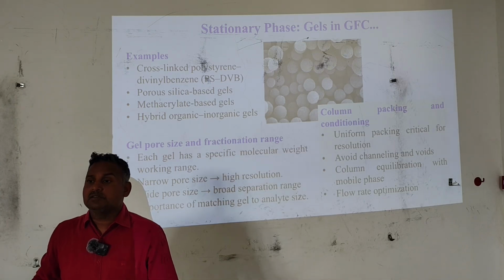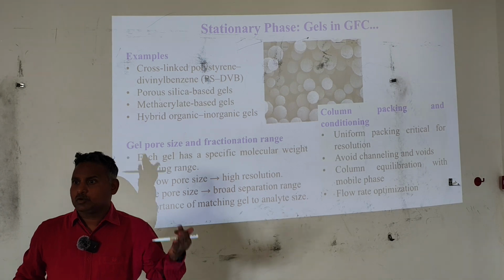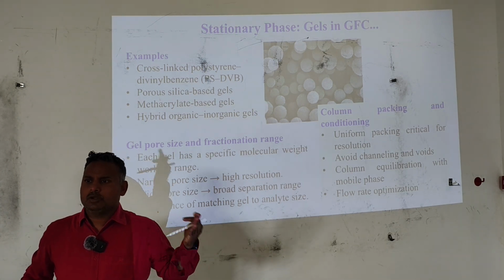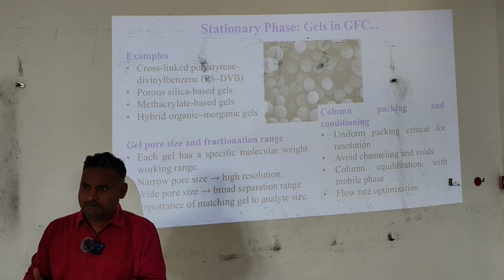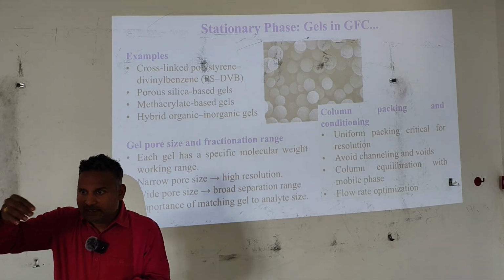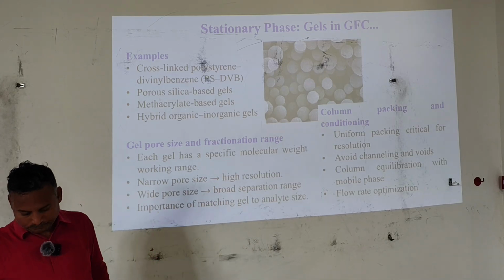In the practical session, there will be column packing. It may not be GFC column packing, maybe another column packing. If you know other column packing, it will be equally applicable here. Okay? So you need to take a little and try to pack it uniformly. Right?